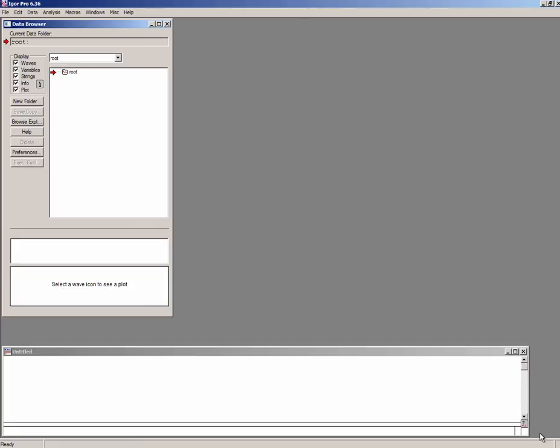I do show this type of analysis in IRENA and NECA courses which are held about twice or three times a year at various places, mostly at the APS. So in this case I want to walk you through an import of the data and pre-processing of the data, plotting of the data and then analysis itself, so you understand how to grapple with the small angle scattering data.